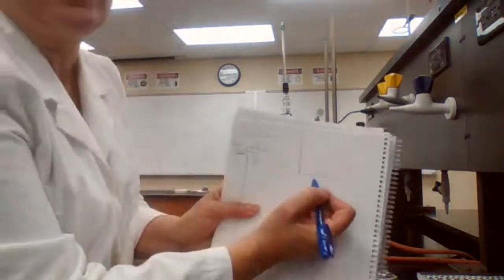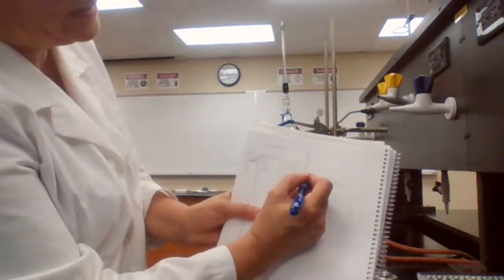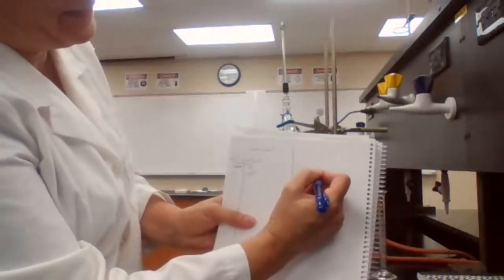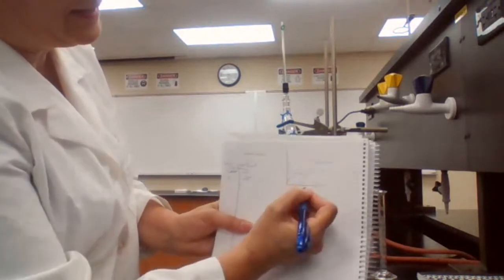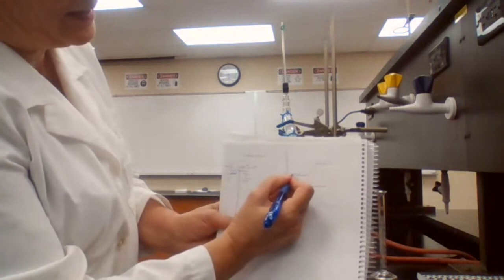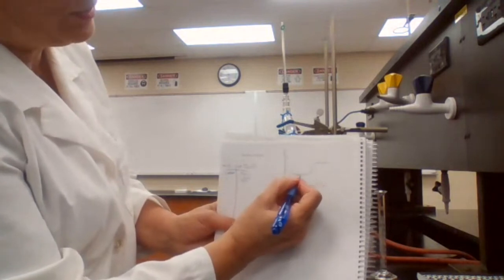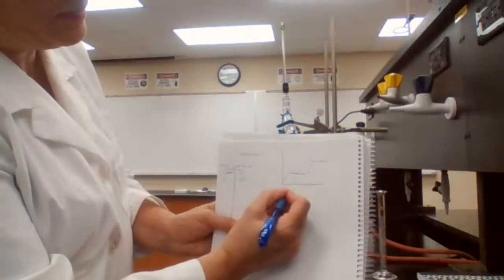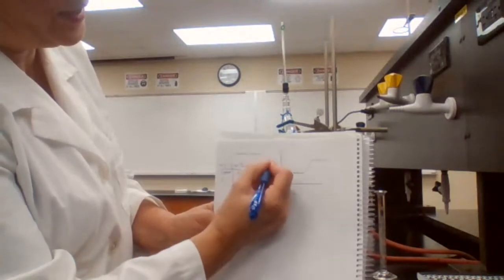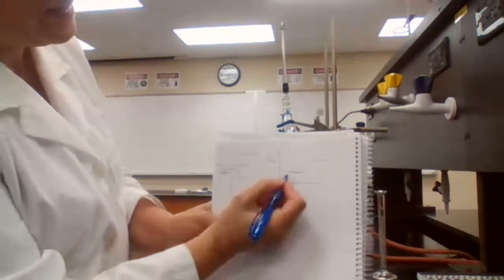For a perfect distillation, the temperature is going to increase. It would stay flat. Temperature is going to increase and stay flat. The first plateau, or the flat part of the graph, this is the milliliter or volume versus temperature graph.